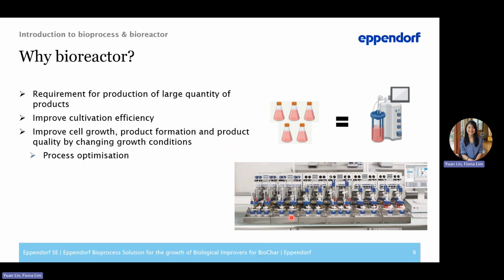In other words, your process can also be optimized to generate your cells in the best condition for your experimental study. So optimization could be performed in such small scale bioreactor. The working volume for this bioreactor is 60 to 250 ml, and you can test multiple parameters in case you are running some kind of process optimization studies for the cell strain that you are trying to improve.